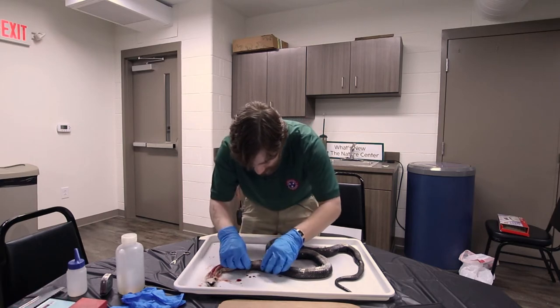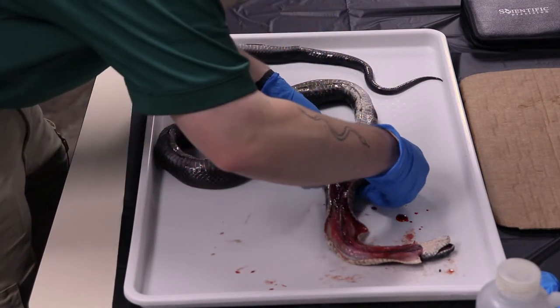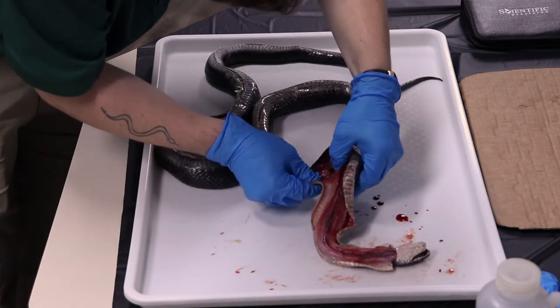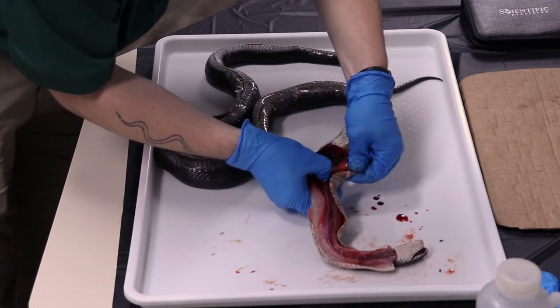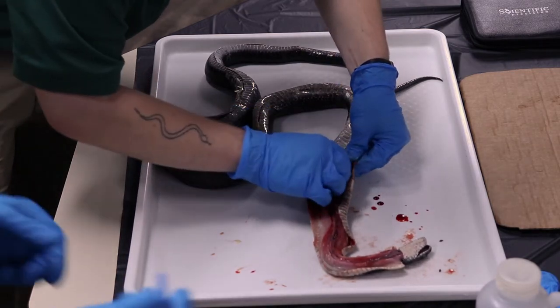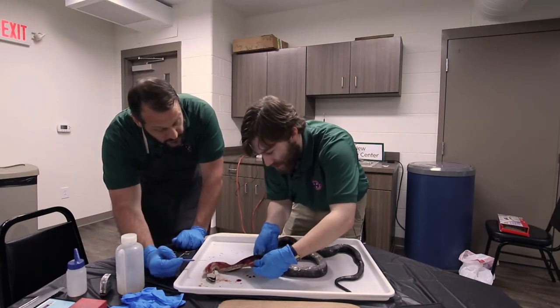Okay, so it looks like it does have some injuries in this area. Let me try to get the skin peeled back. You can definitely see around the outside on the skin here, it's all bloody. Got some injuries there. That's where it's probably hit.